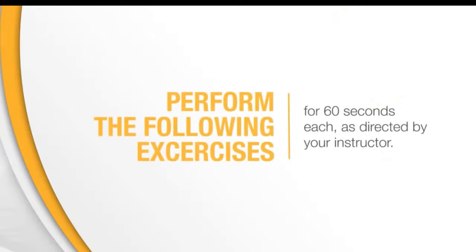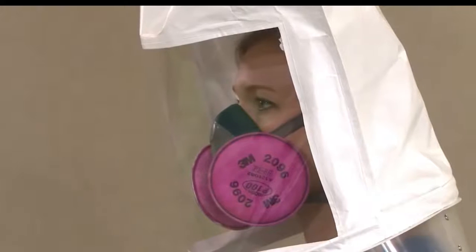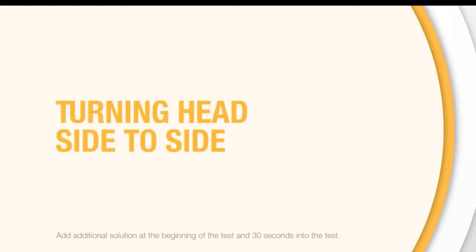Perform the following exercises for 60 seconds each, as directed by your instructor. 1. Breathe normally. 2. Breathe deeply and regularly. 3. Turn your head from side to side, stopping for a breath at each side.